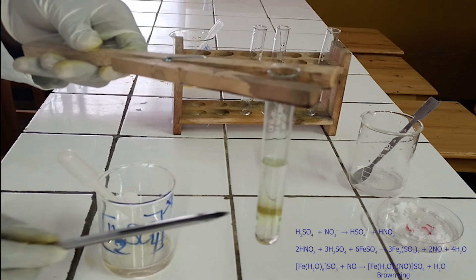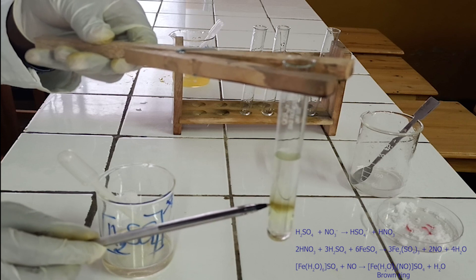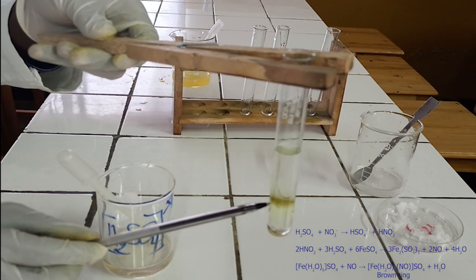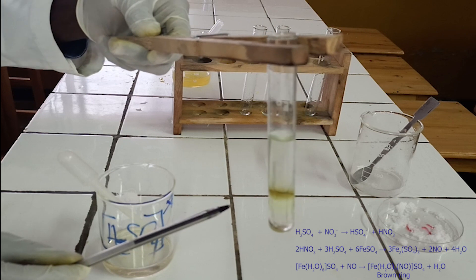When concentrated sulfuric acid is added to a solution of iron-2-sulfate and a possible nitrate, the acid sinks to the bottom. This is due to the fact that concentrated sulfuric acid is denser than the solution.